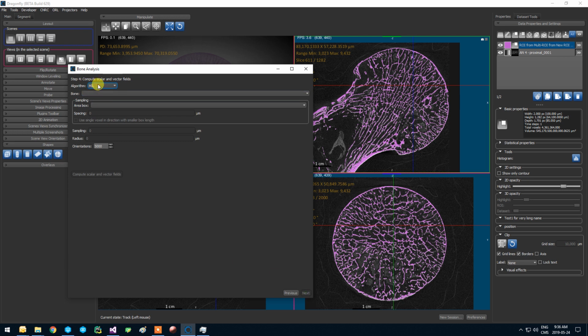So we have in this case 2000 points that will be taken in the sample. But with this mapping for the MIL, we take a single point and we take a star at that point. We compute the MIL only at that point, and that provides the value of the anisotropy at that location, and we repeat that procedure for each point. So this is a bit different. This algorithm provides a value of anisotropy for an area, but it's quite noisy. We will see that in a moment.